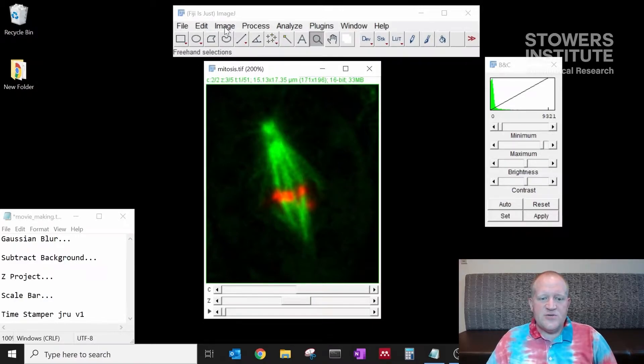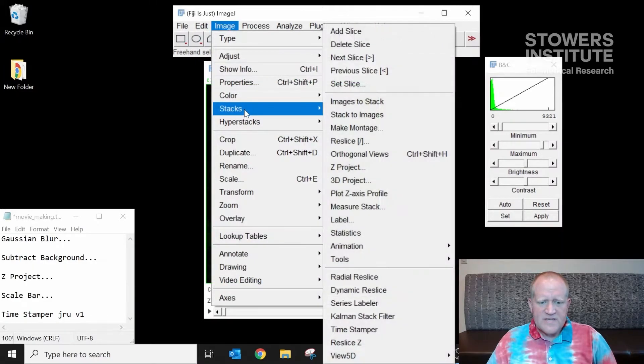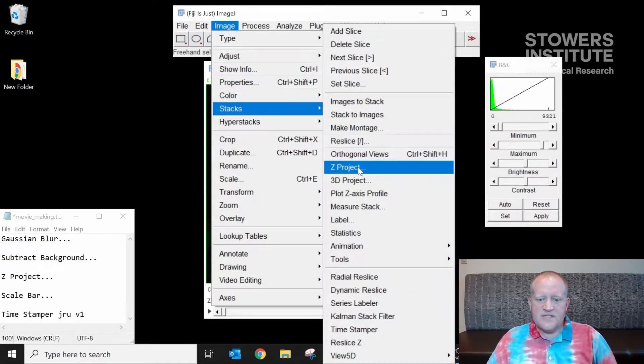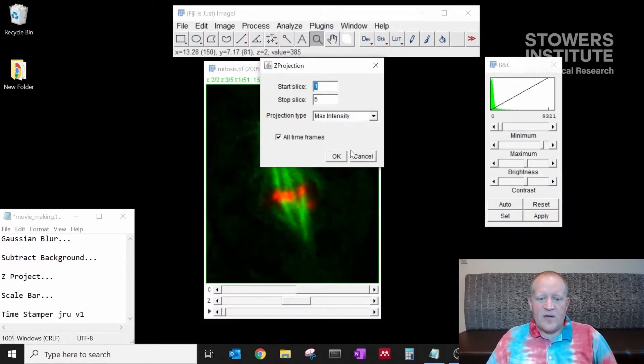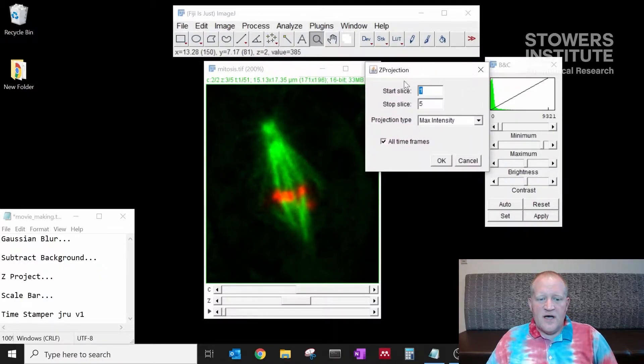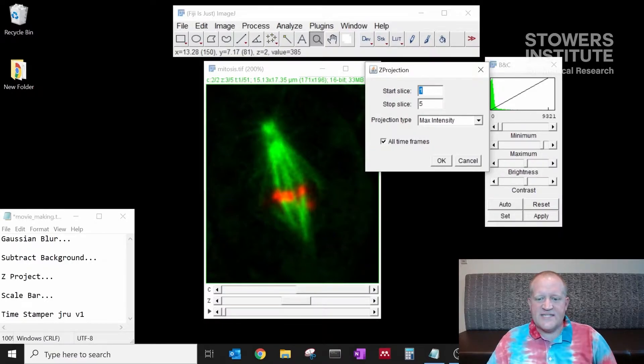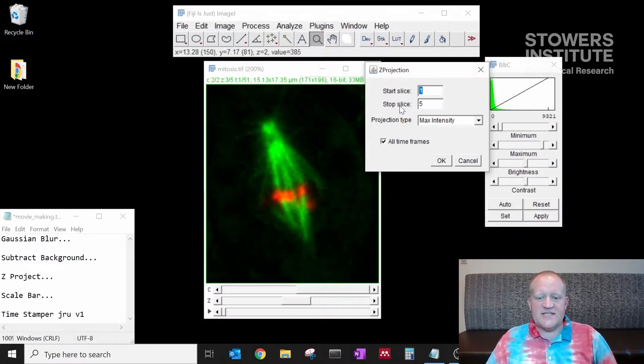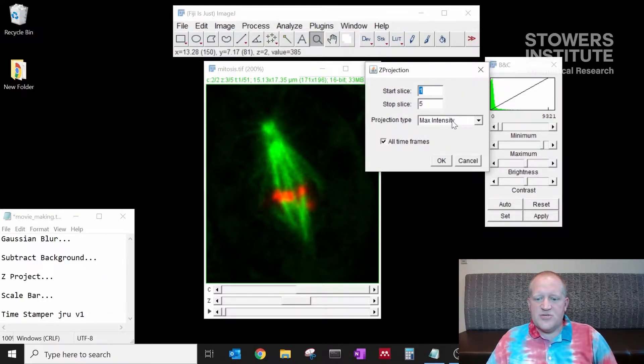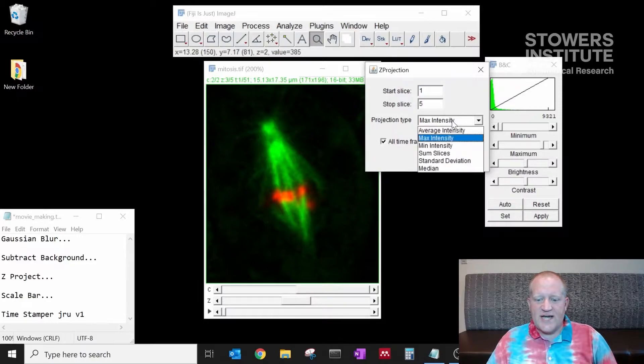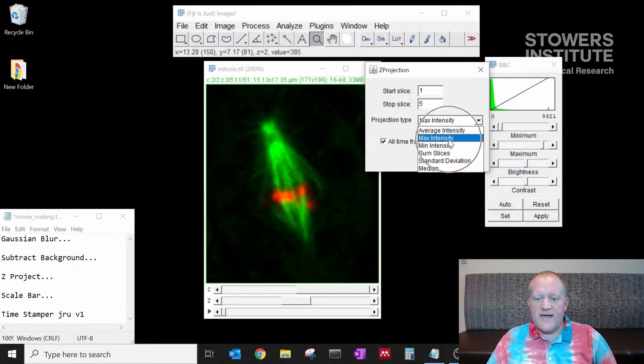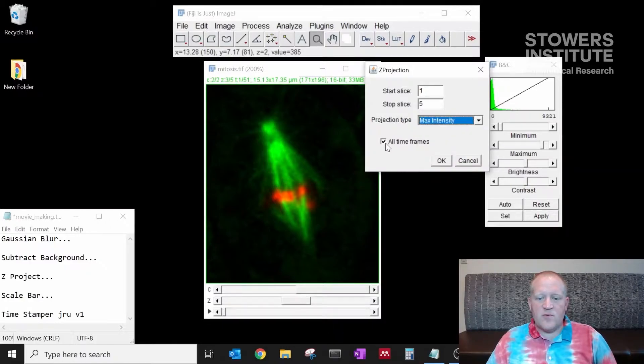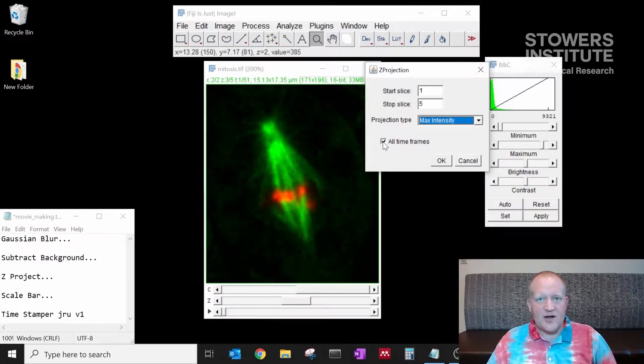We're going to go to image stacks z project and we have some options here. You notice our data set has 51 time points and five z slices. The start slice and stop slice are the top and bottom of the z stack. We can choose our projection type. You can do sum, max min, whatever you like. We're going to do max today and we want to make sure that we have selected all time frames so that it max projects the entire movie.